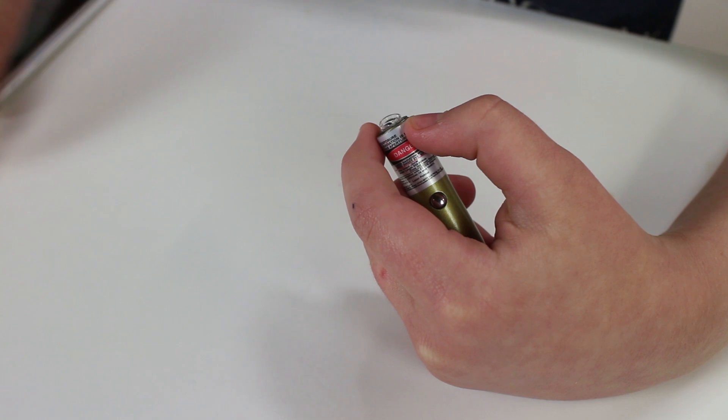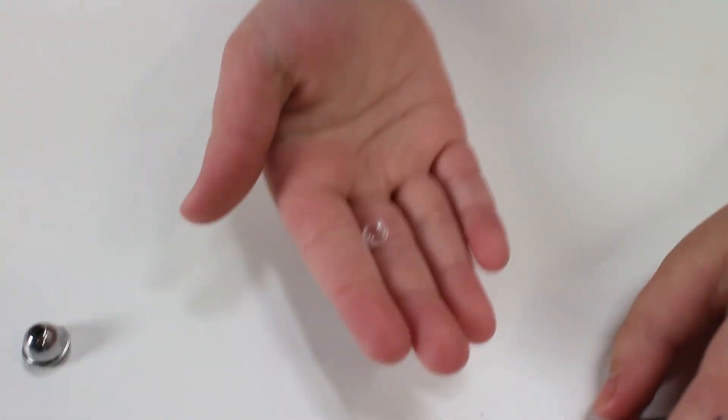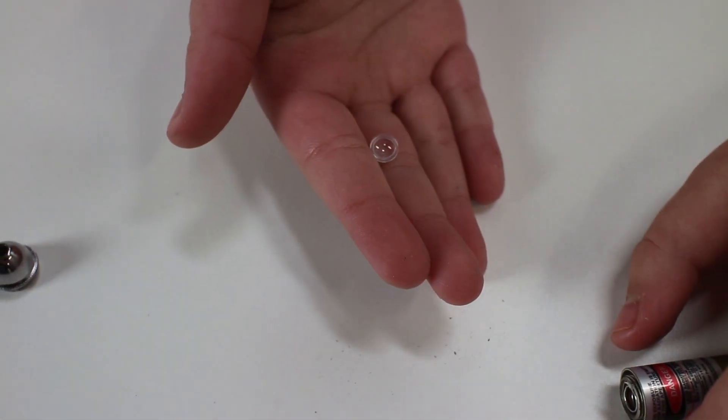So we're going to take the lens out of one of these and we'll show you what it looks like. This is the lens that was inside of the laser pointer. I had no idea that laser pointers had little lenses like this, but now I do know — I'm really excited to start working with this and turn my phone into a microscope.